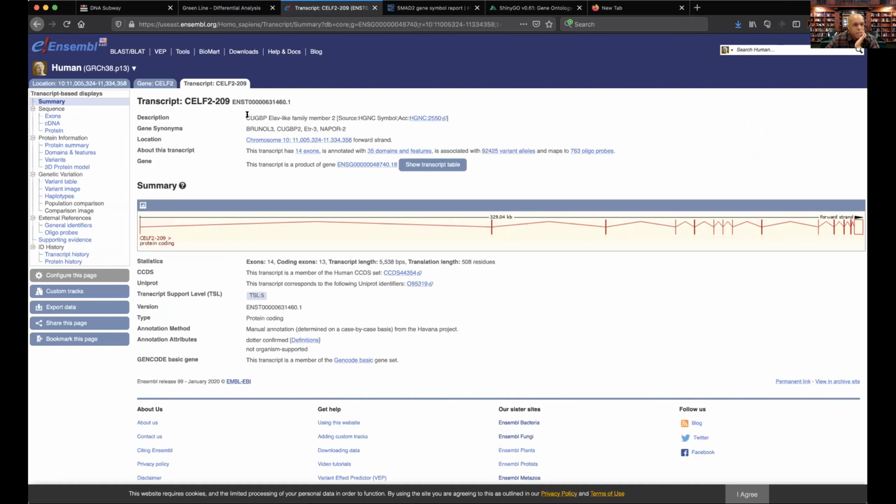And if I look at this, it's going to tell me a little bit of information about the gene structure. And then I may want to go and find some additional information about this. And you could even go ahead very simply. Well, if I go back to gene versus transcripts, it gives you a tab here on the left-hand side.